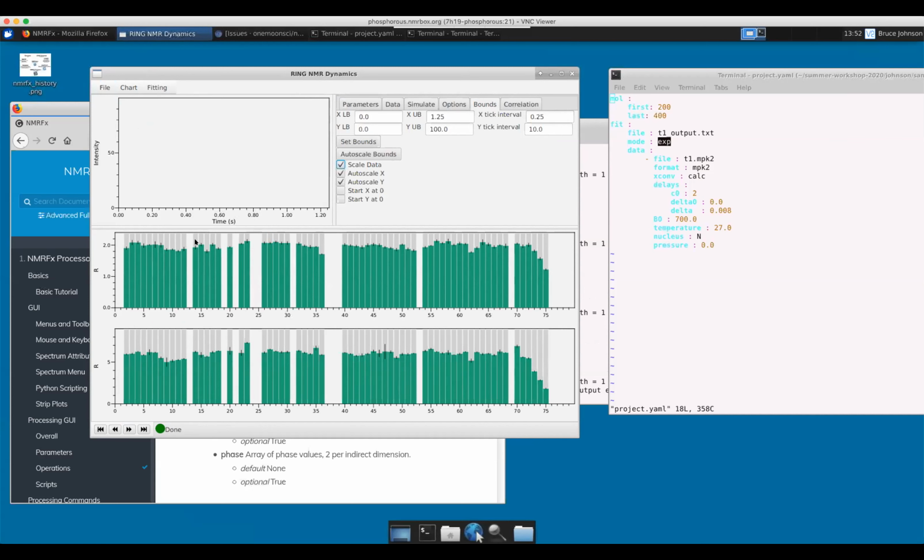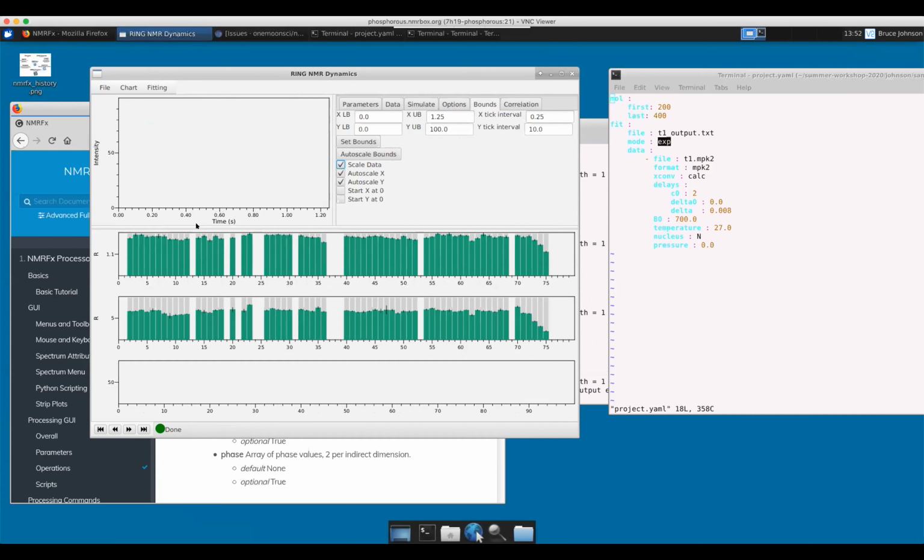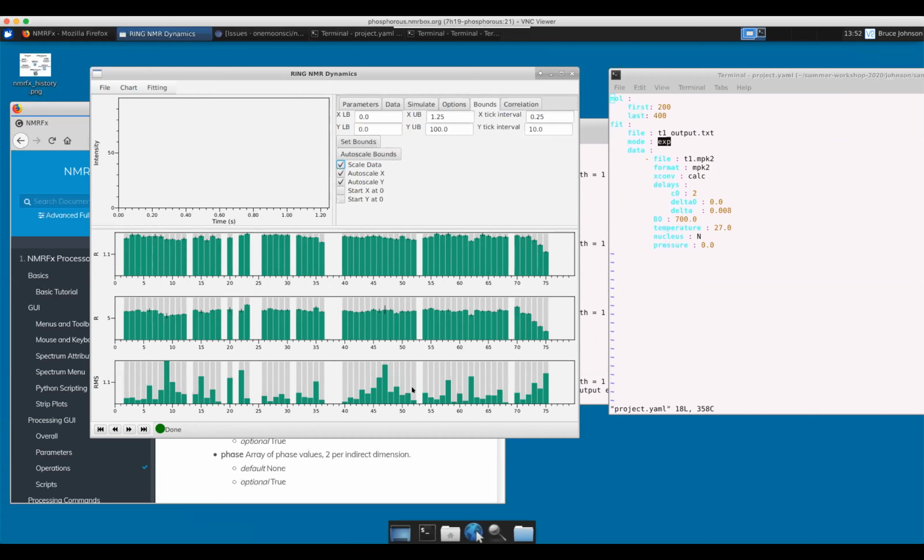There's lots of other values that are displayed. So if we add a new chart, we could go in and add different types of data. If I wanted to see the root mean square, look at which values had more or less error to them, we could go through and find one, say, oh, this guy has kind of high error, so let's go up and look at it.